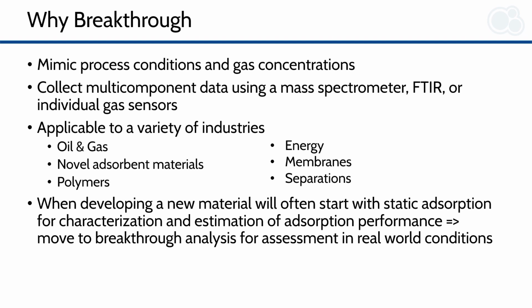In most cases in industrial processes, there's not one single component in the mixture of gases that you're looking to capture. There may be multiple different components. They may interfere with some of your adsorption sites, so you need to be able to take that into account, which is not something that can be done using these single component analyses, which is why you might want to move on to using breakthrough or some kind of multi-component analysis procedure.